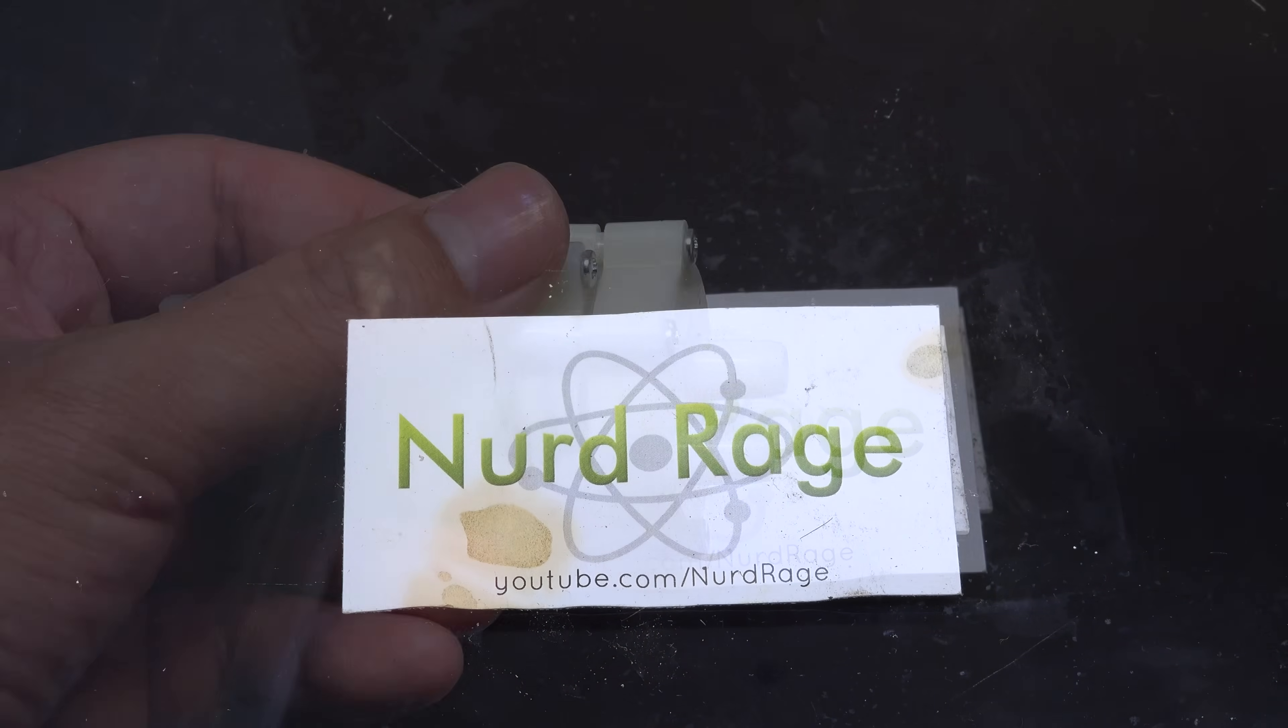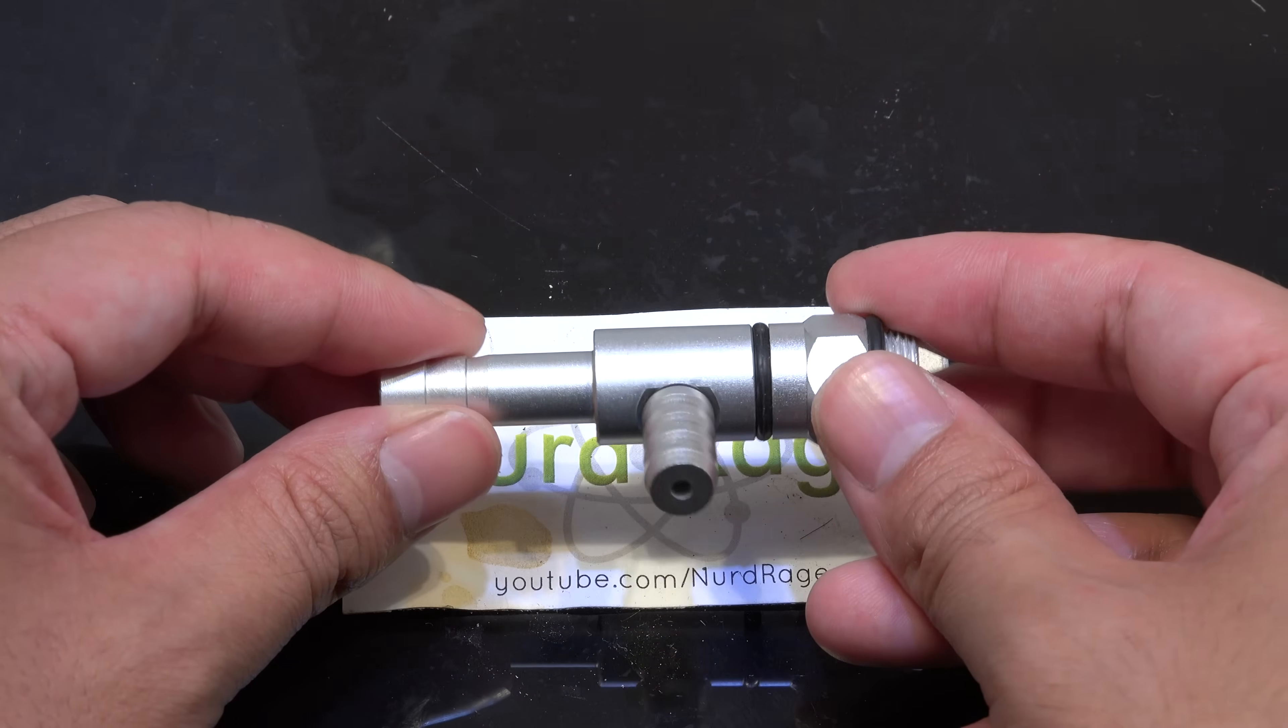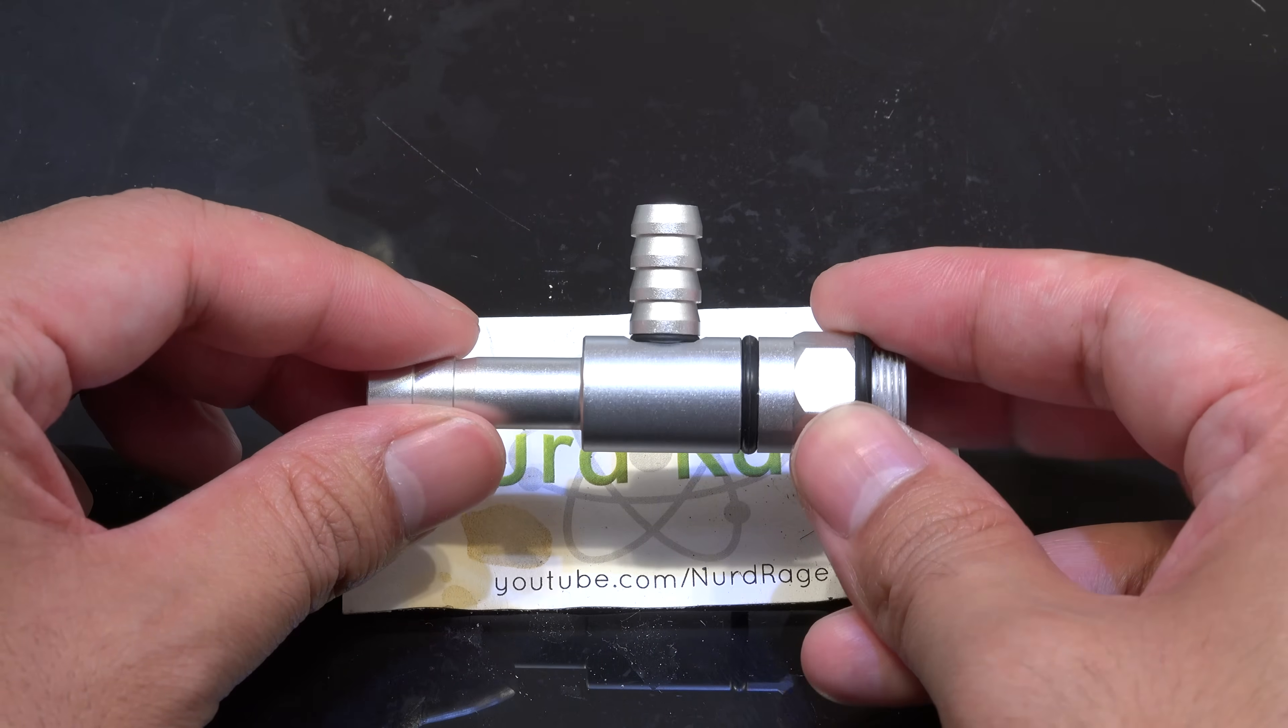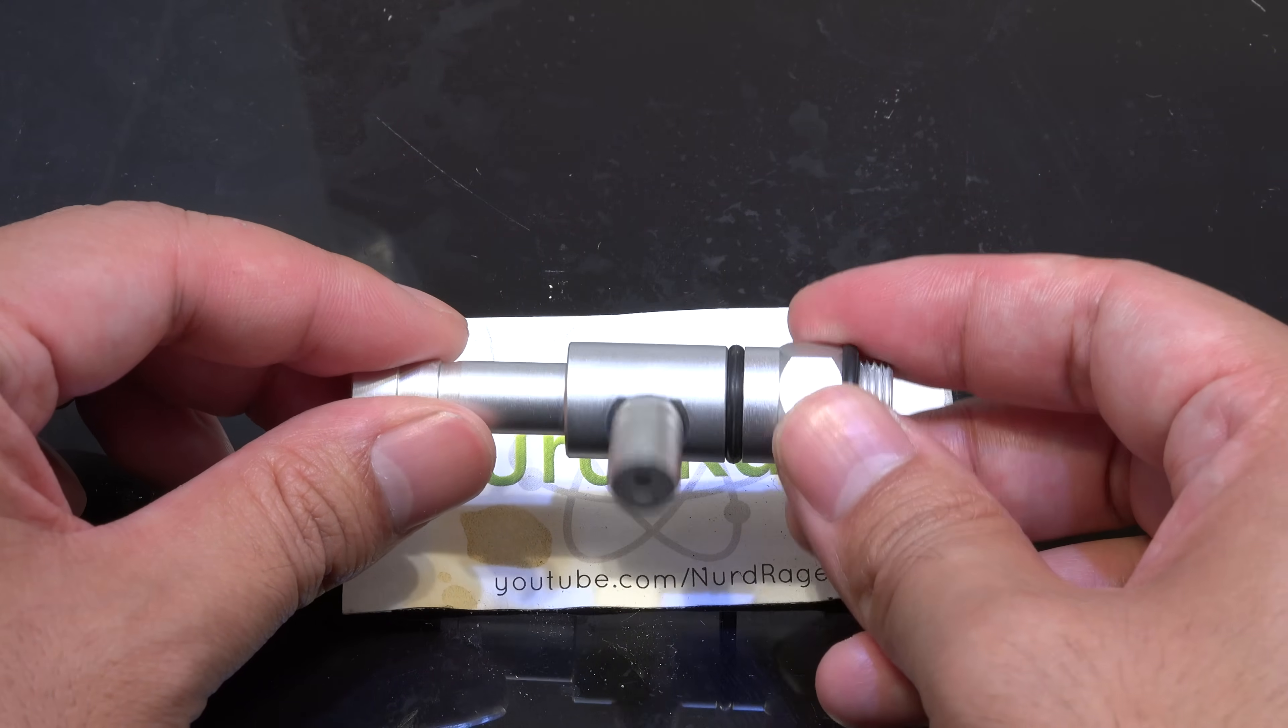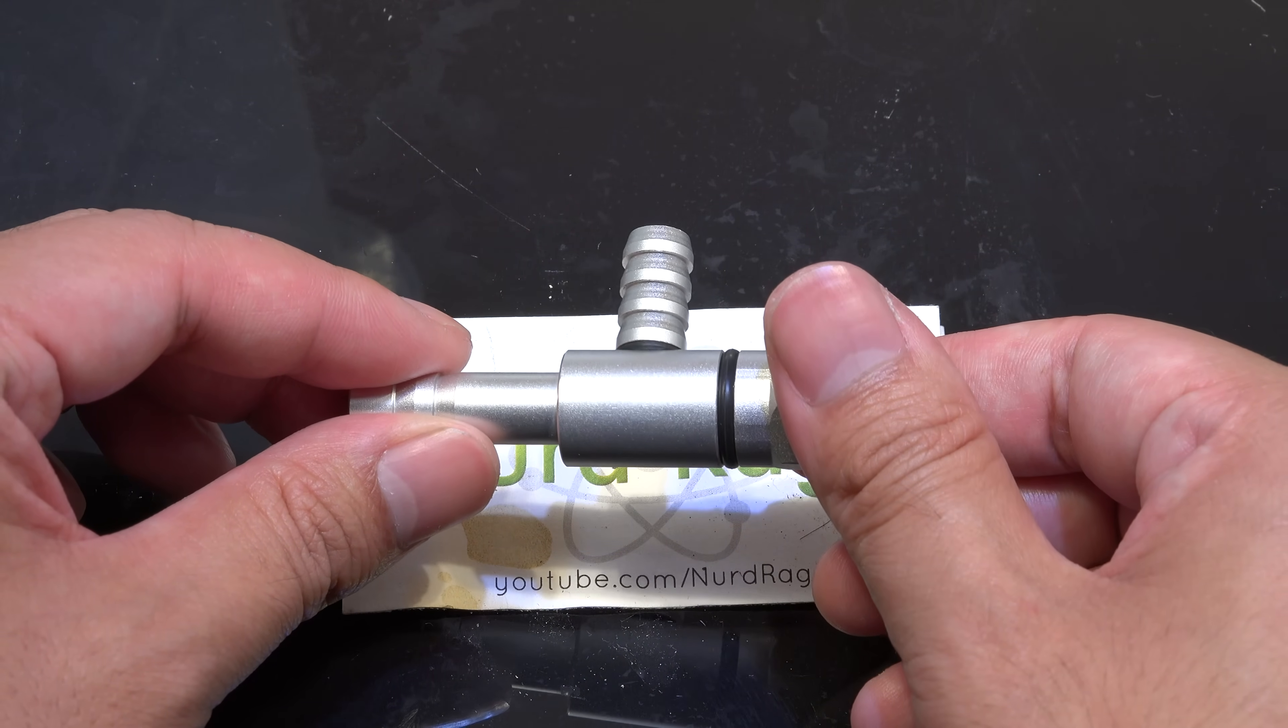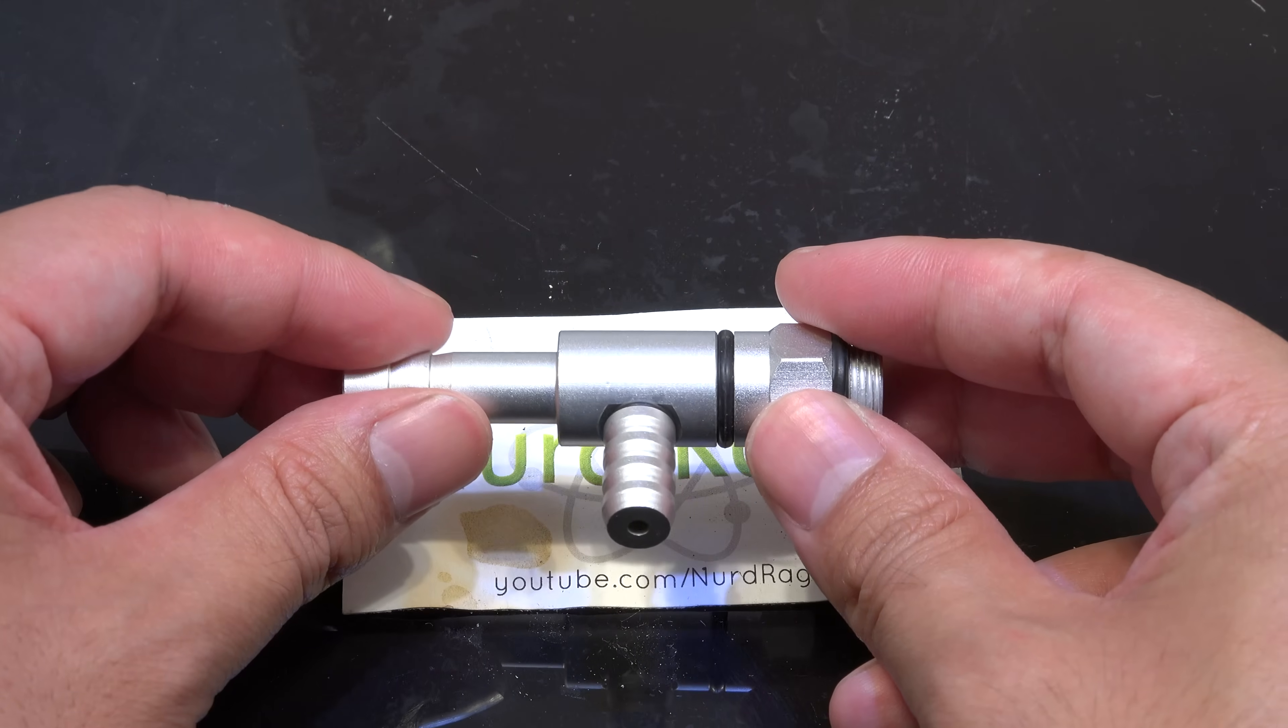Something a lot more powerful is this aspirator pump. You can purchase these easily online and I got mine for just ten dollars. You can also get all glass ones for a bit more, but worth it if you're doing a lot of acid distillations.